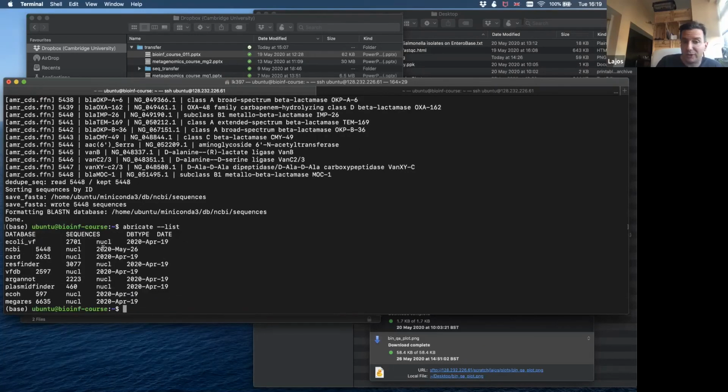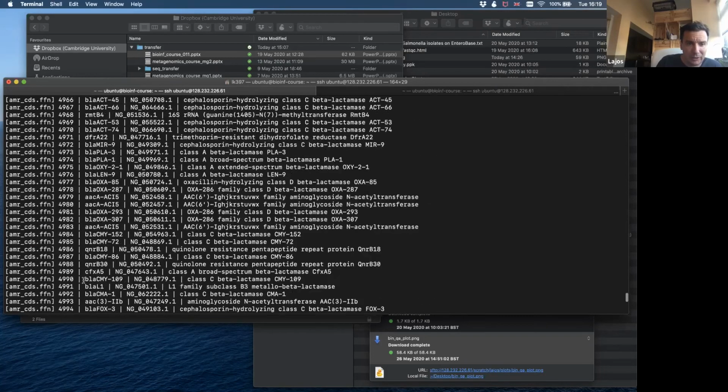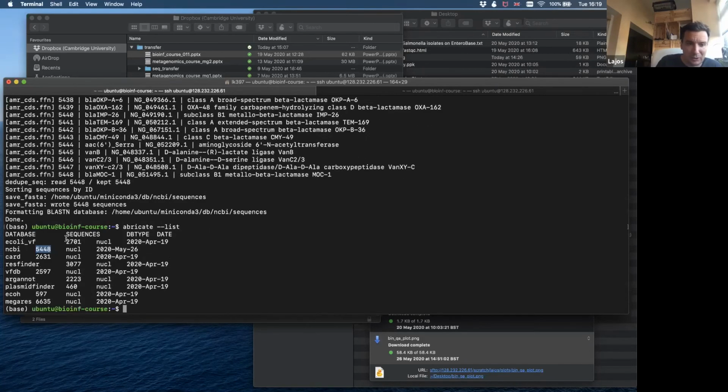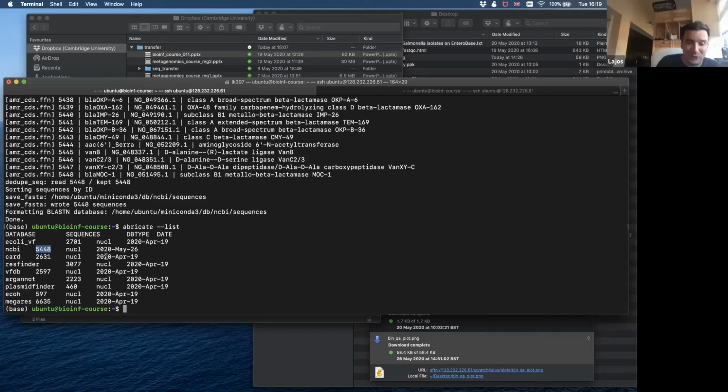Yeah, so actually it is now a bit newer. I don't know if we have more genes. So we have now 5,448, and we had, oh my God, I cannot go back. Do you have the old numbers, Joe? Did you update? Oh, you did the update as well. Okay, perfect. No, I haven't done the update.